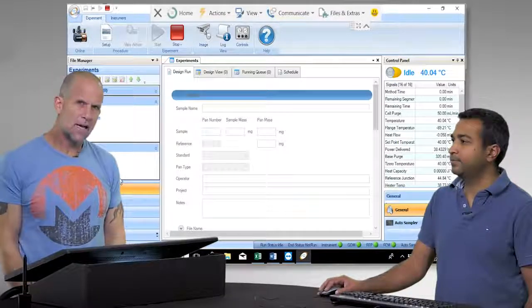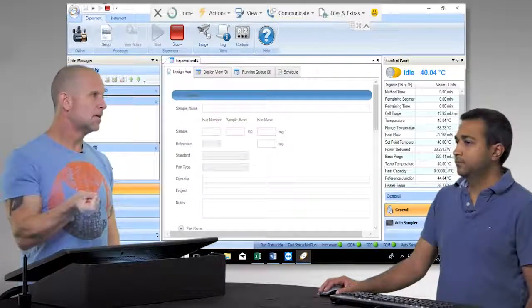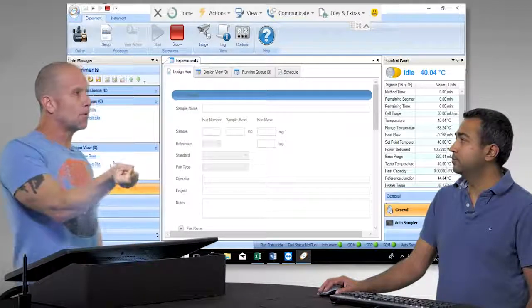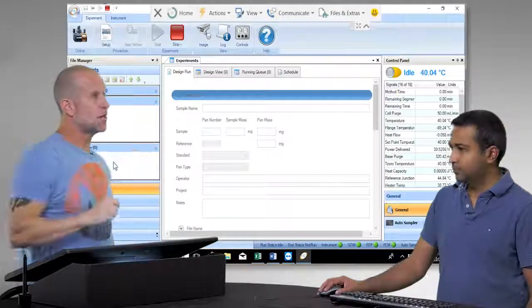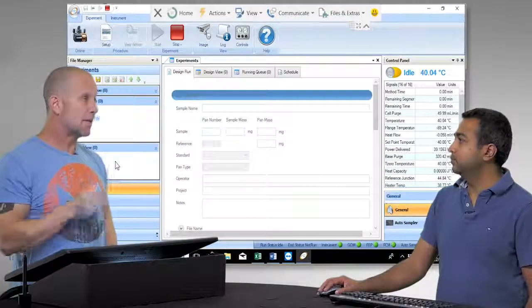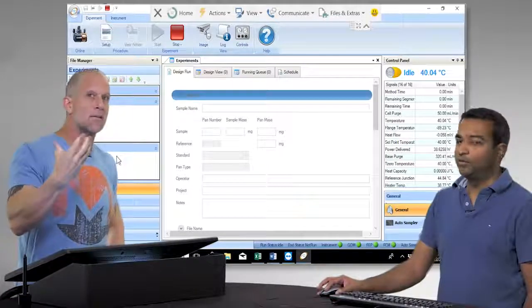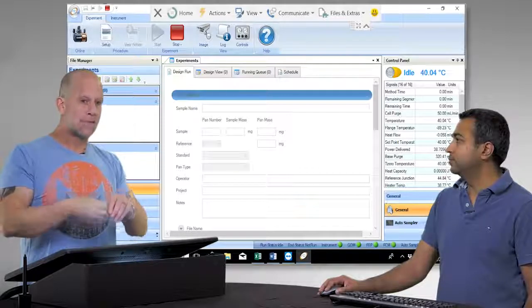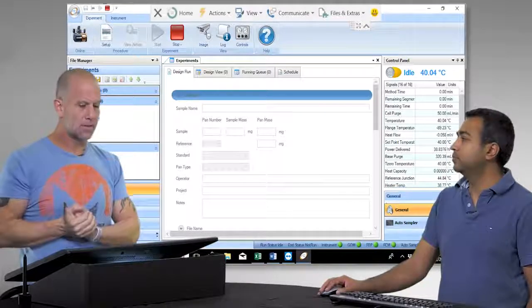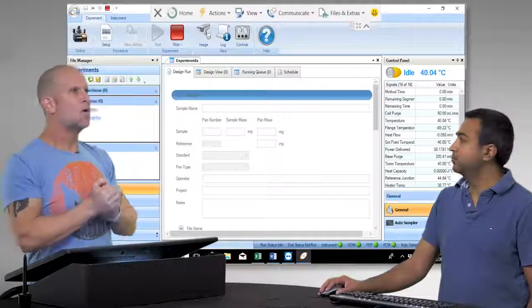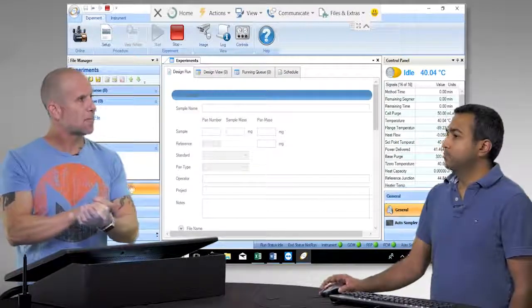What we want to do is show from scratch that we've sealed a sample of indium and put it into auto sampler position number three. It weighs about five milligrams. We have the weight of both the sample and the total weight of the sample and the pan it's in. This was a hermetically sealed sample.